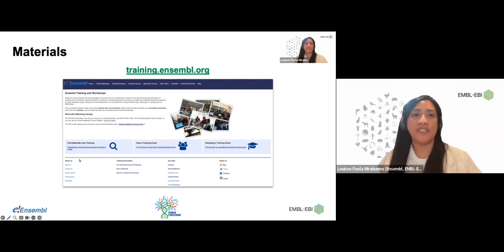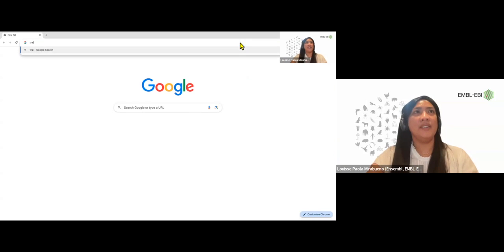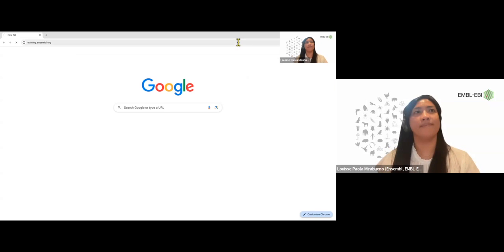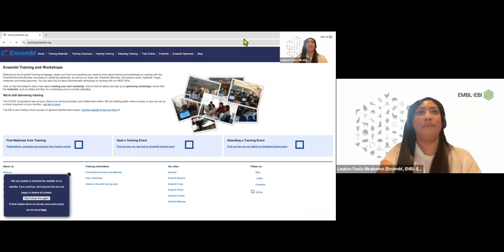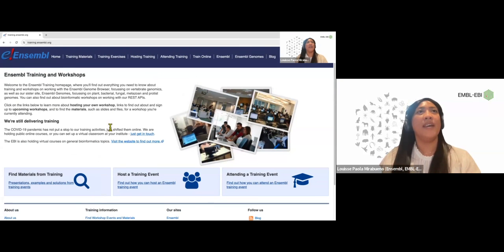So all of my slides will be available on our training page. I'm just going to show you how this looks. If you open your browser and go to training.ensembl.org, I'm going to do this on my screen right now. I've switched to Google Chrome. It will work with Firefox just as fine. You can type in training.ensembl.org. Zoom in a little bit so it's a bit bigger for you.